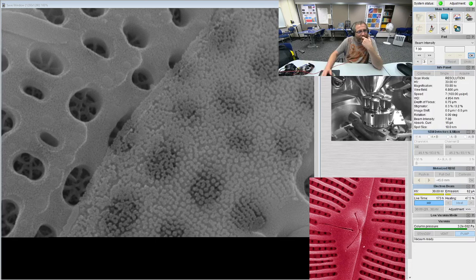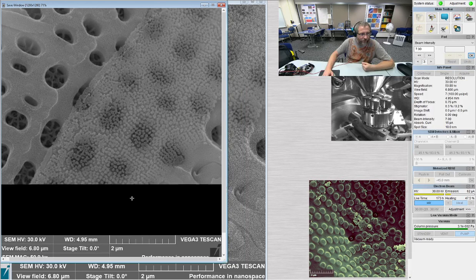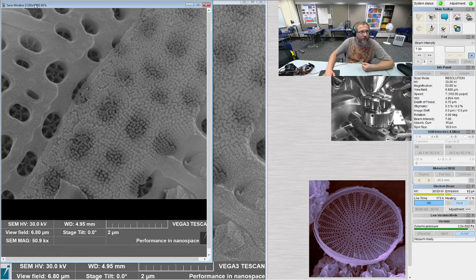Those are fascinating. So at this scale, what is that across, like a few nanometers within the holes within the holes? So there's the scale bar. The whole field of view is 6 microns, 7. And if you wanted to know, like, let's see, you're asking how far is it from, oops, I don't want that. I want the, what's this thing? Somebody's been messing with my settings.